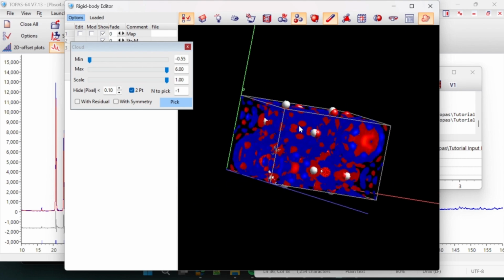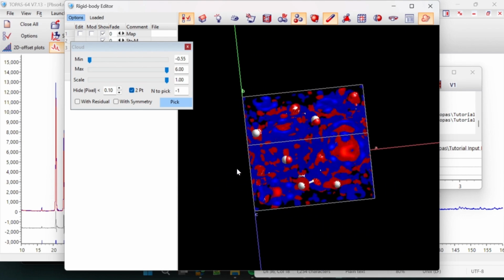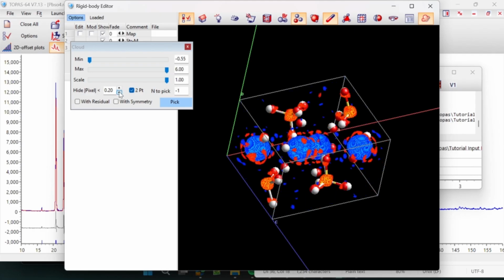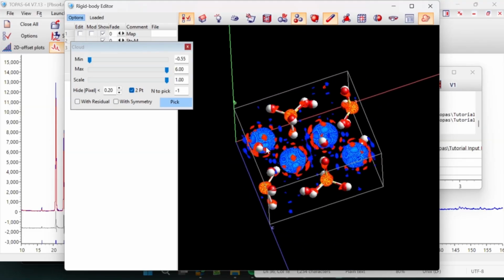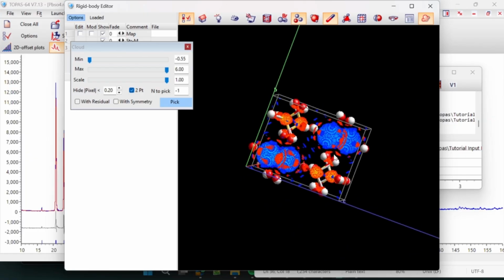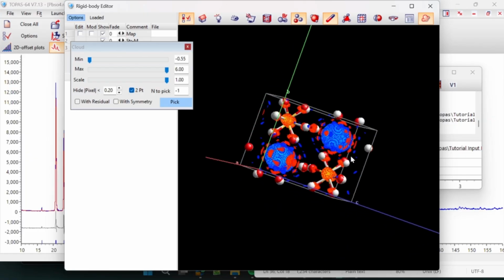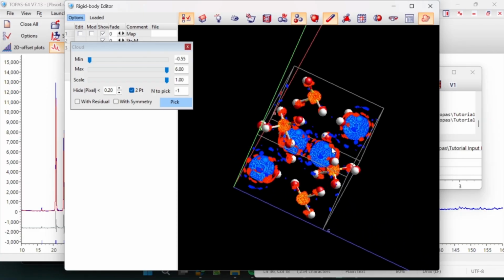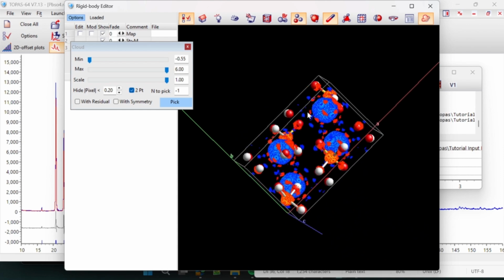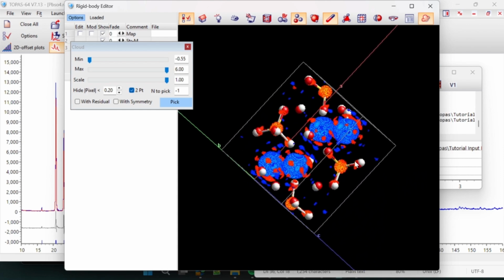We can see everything's in the right sorted place. I'm looking for any sort of points where I think the positions might change. We're going to refine all of the positions we can anyways.